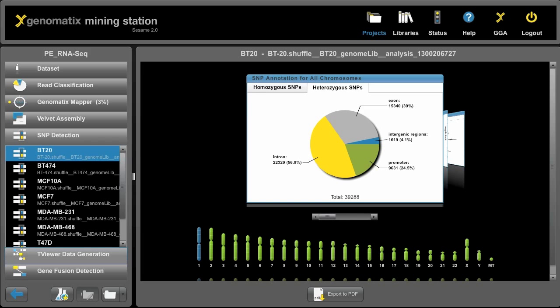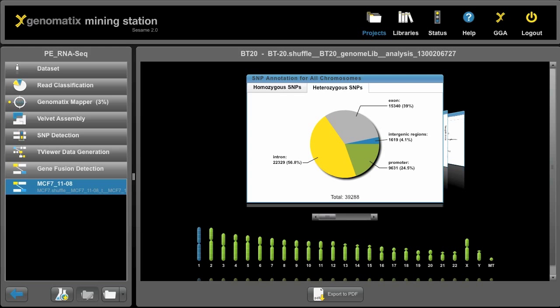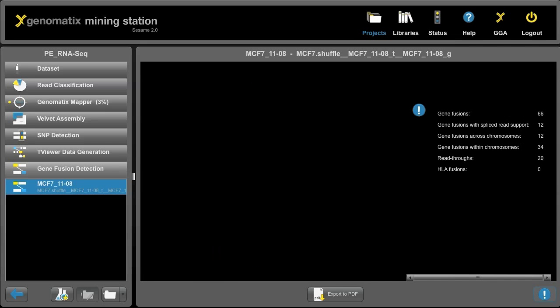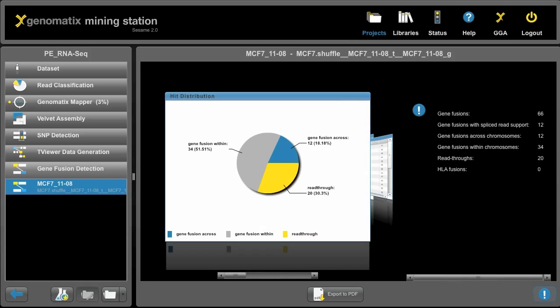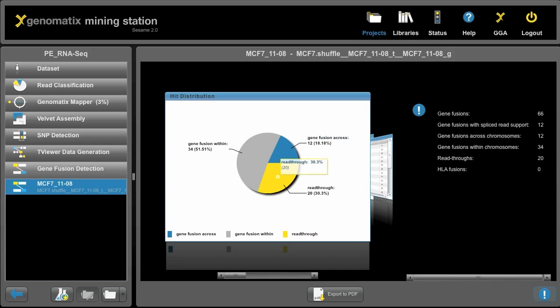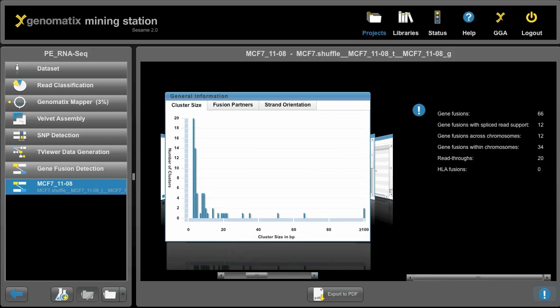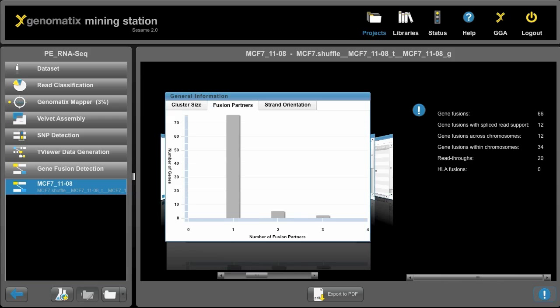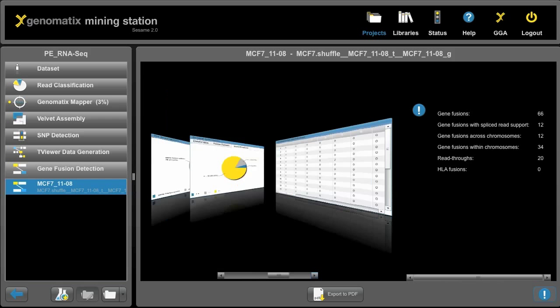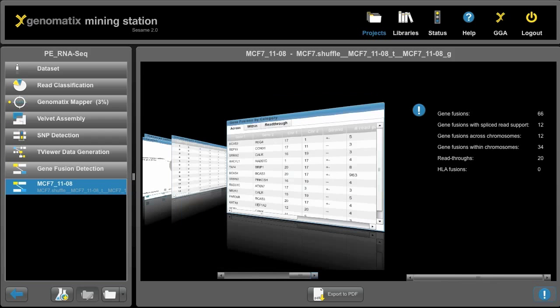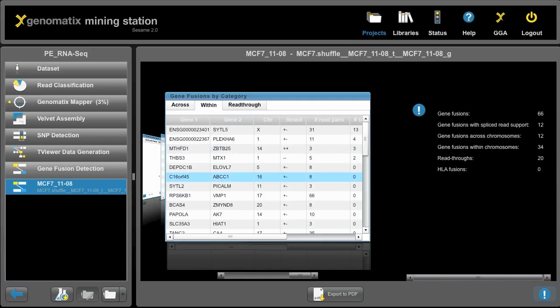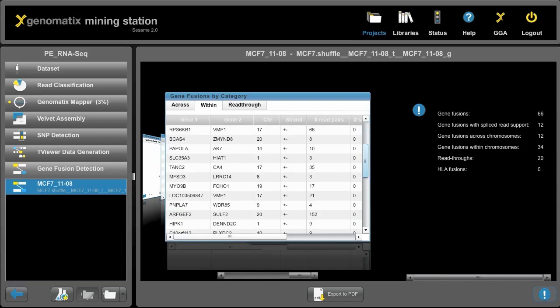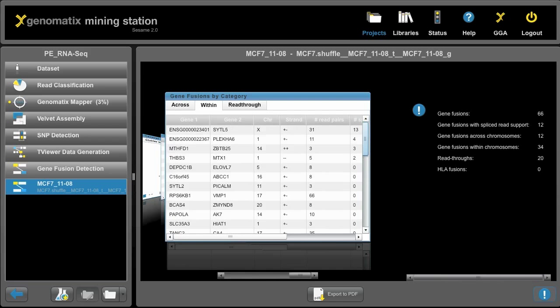We can also look at the gene fusion detection that we run, for example on MCF7 here, so you can click on that and you get results about gene fusions within a chromosome, across different chromosomes, or read-through candidates. And you can have a look at things like cluster size, fusion partners, strand orientation, and also look at the gene fusions in a table, gene 1, gene 2, across different chromosomes within or read-through candidates, and you can export that data and do more downstream analysis with those.